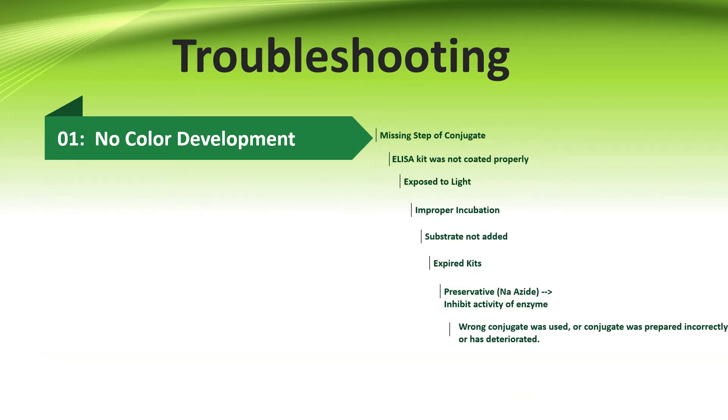If there is no color development after ELISA, the reasons could be: First, missing steps of conjugate. All conjugates are test-to-test specific or lot-to-lot specific — be sure that the conjugate used in ELISA is the one that came with the test kit. Second, the ELISA kit was not coated properly. Third, during chromogen addition, the plate was exposed to light. Fourth, improper incubation. Fifth, if the substrate is not added properly, so it is very important to check the product insert of the assay protocol.